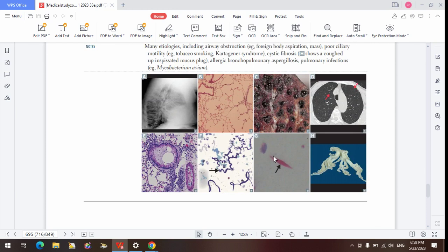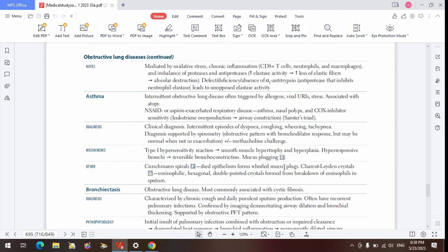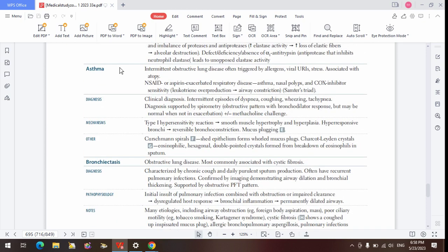And this other one that we are seeing as a pointed sword is called the Charcot-Leyden crystals. Charcot-Leyden crystals come from the eosinophils present within the airway being broken down. Some eosinophilic proteins are broken down because the cells get killed off and recycled, with new ones coming. Part of the product that they release includes the Charcot-Leyden crystal. If you see them, they point towards someone with asthma. And there's another thing that we need to know before we move on from asthma. And what is this?